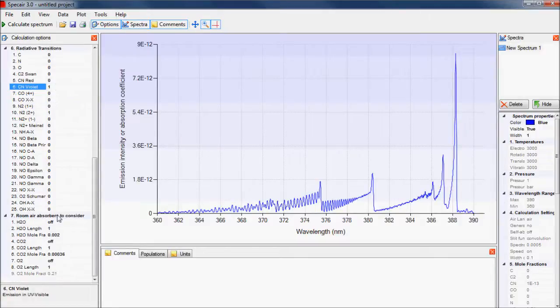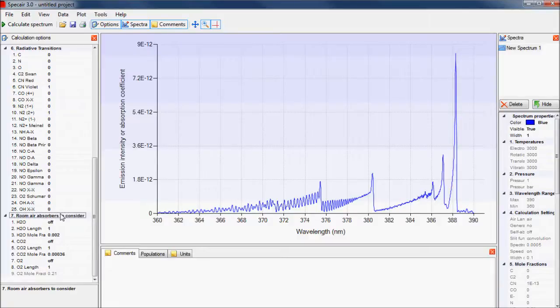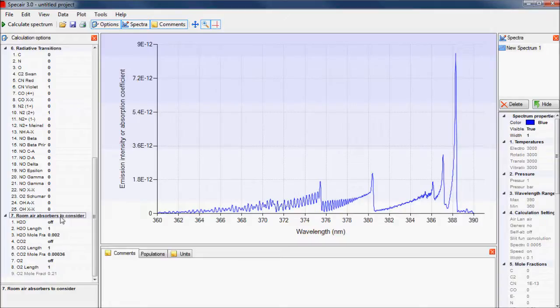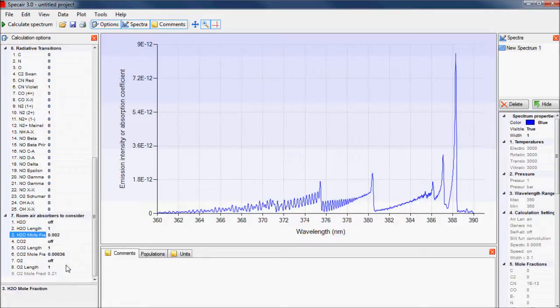The last section in the calculation options allows the user to add room air absorbers to take into account the absorption from air between the plasma and the spectrometer. The path length and mole fractions for water, oxygen, and carbon dioxide can be adjusted.